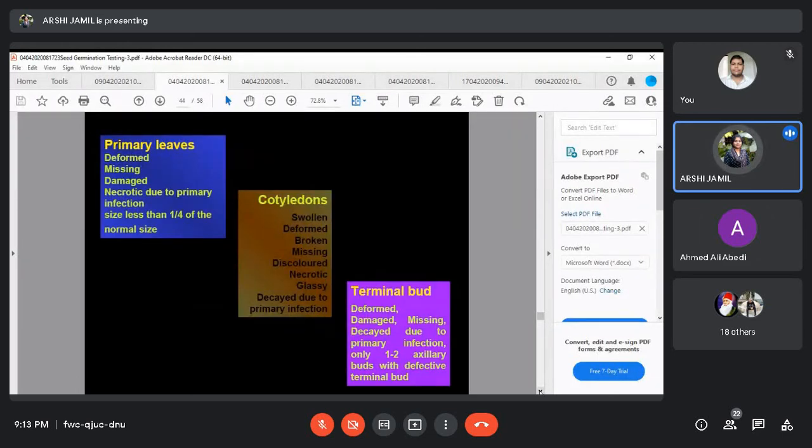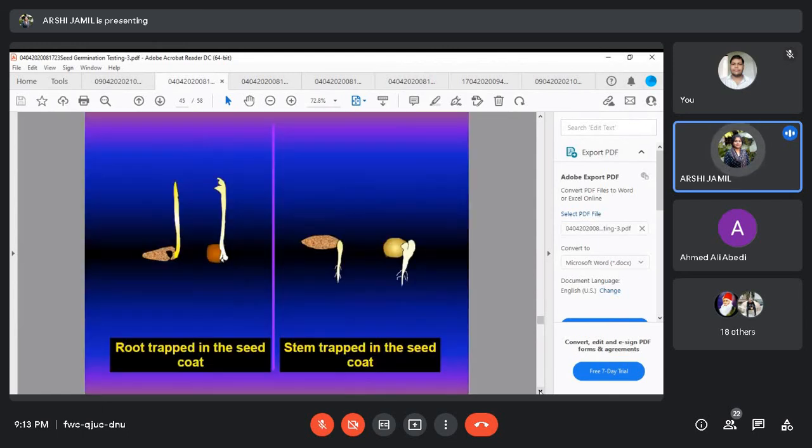प्राइमरी लीव्स जो हैं वो डिफॉर्म्ड हो सकती हैं, मिसिंग हो सकती हैं, नेक्रोटिक लीजन्स उस पर हो सकते हैं, नॉर्मल साइज नहीं हो सकता, या कॉटिलेडन्स जो हैं वो कुछ ज़्यादा ही स्वेल कर गए हो, डिफॉर्म हो, उनका कलर वेरी हो गया हो, डिकेइंग हो गई हो, टर्मिनल बड जो है वो डैमेज हो गई हो. सो दीज ऑल थिंग्स कम अंडर द abnormal seedlings.